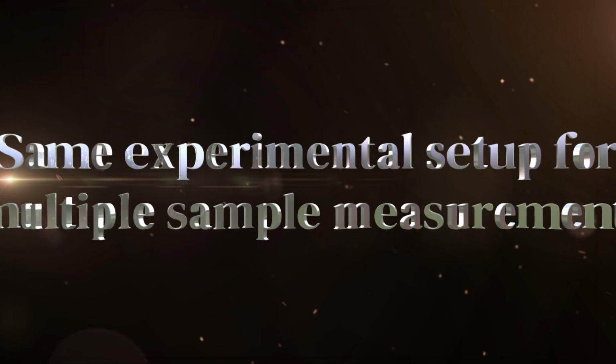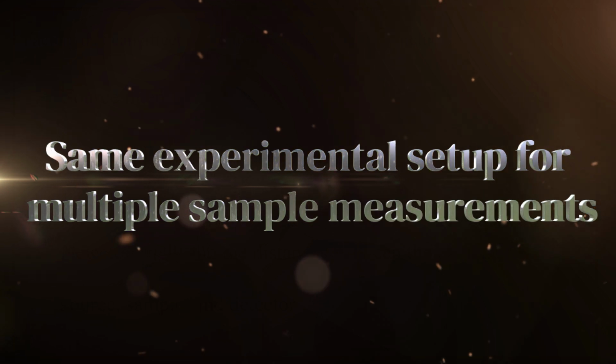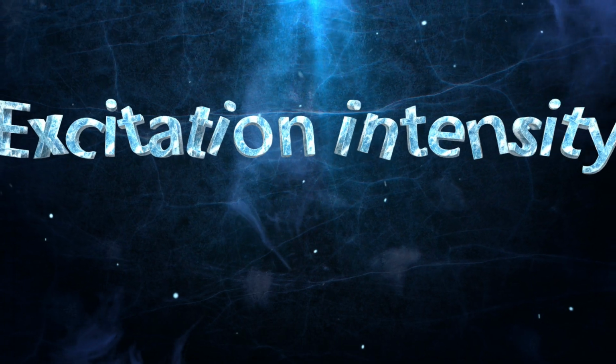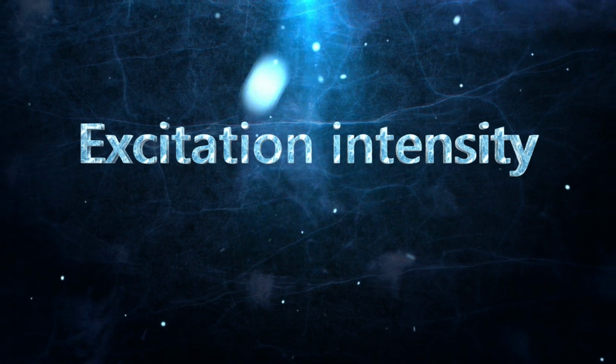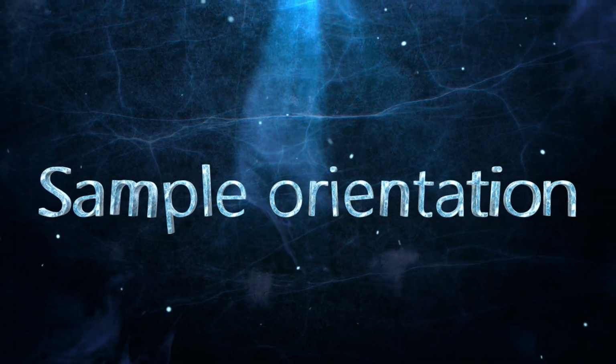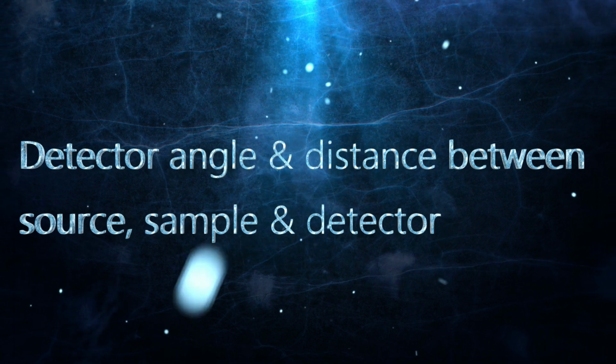Coming to the fifth point, maintaining the same experimental setup for multiple sample measurements. Several factors affect the PL intensity. If you change any of them during the measurement, your data may not be comparable. Next, we can have a look at the factors affecting the PL intensity. That is, first is source intensity or excitation intensity, excitation wavelength, sample orientation, and the detector angle and the distance between the excitation source, sample, and the detector.